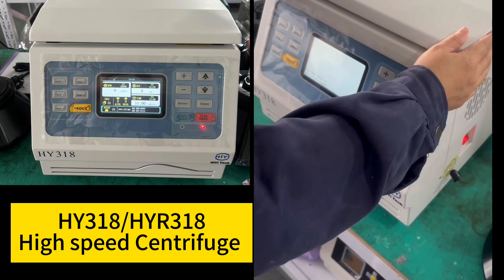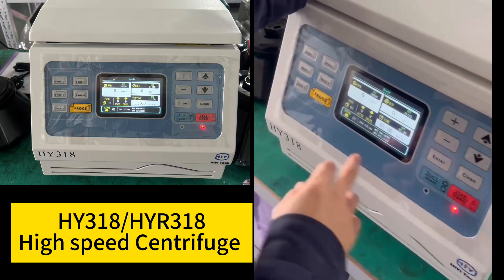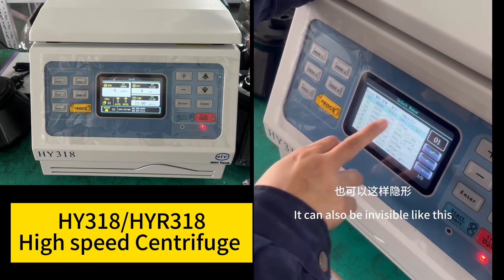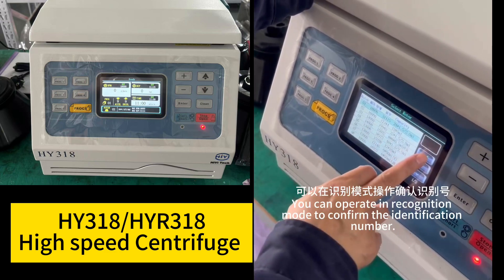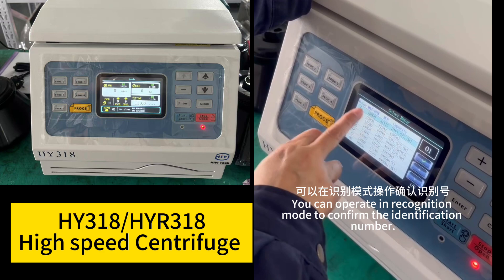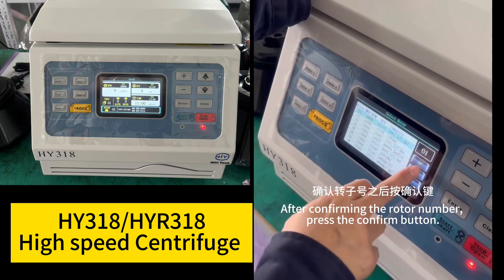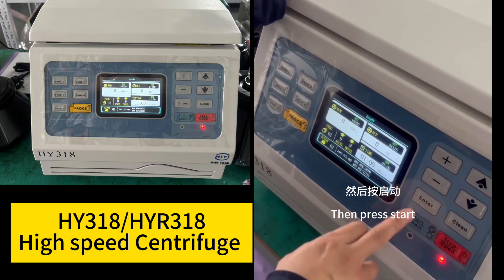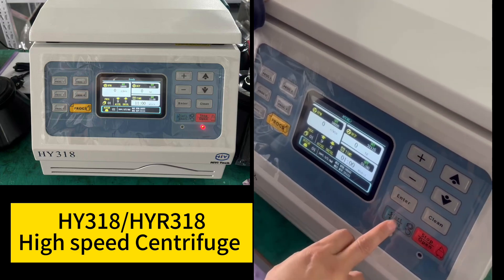Re-energize the machine, find the corresponding rotor number — it can also be selected like this. After confirming the rotor number, press the confirm button, then press start.